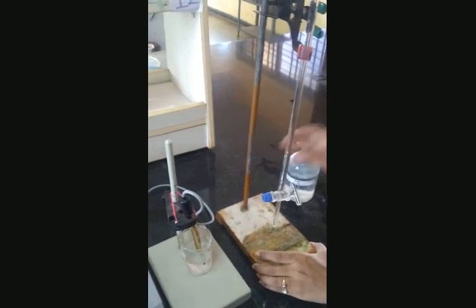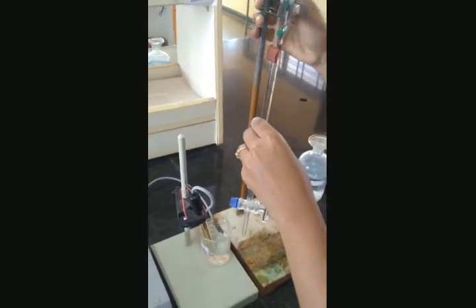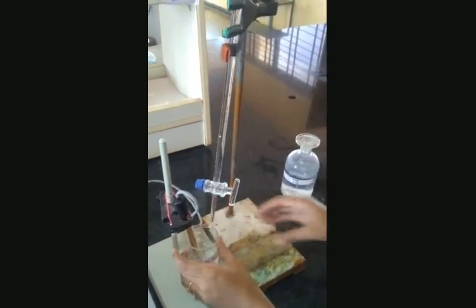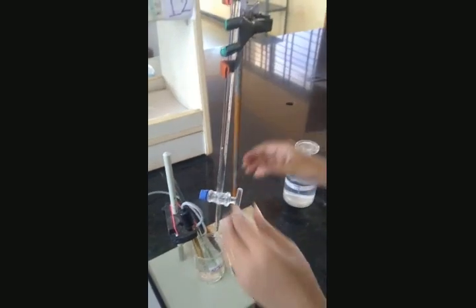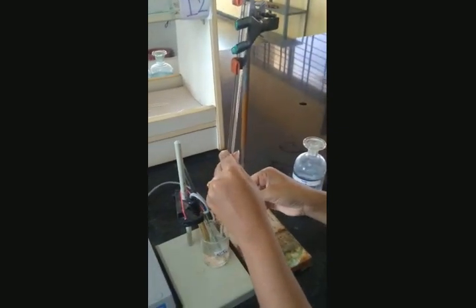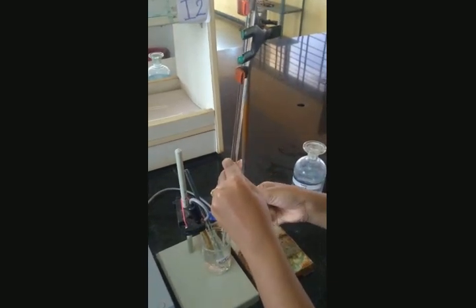Now you go on adding 0.5 cc of sodium hydroxide to this acid mixture, which contains concentrated hydrochloric acid as well as the acetic acid. Go on adding 0.5 cc, shake well the contents and note down the change in the conductivity values.